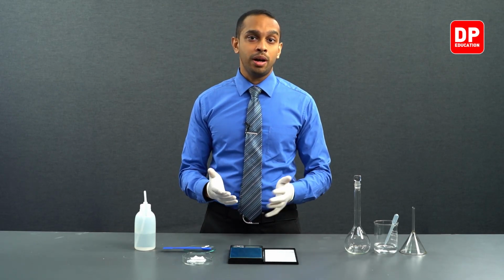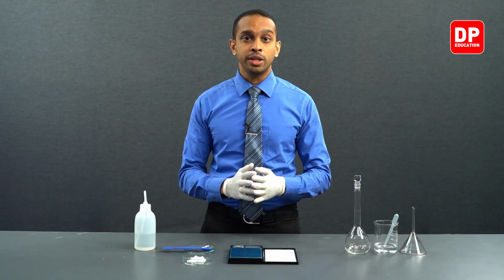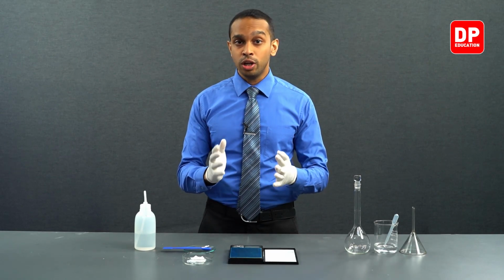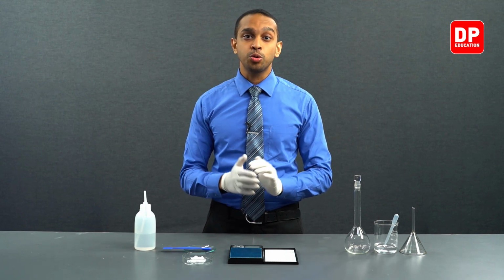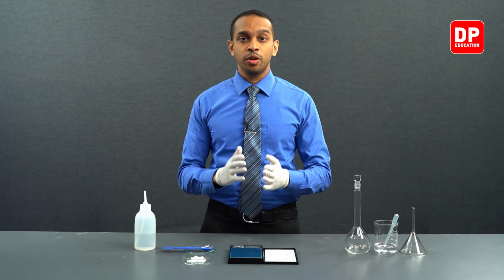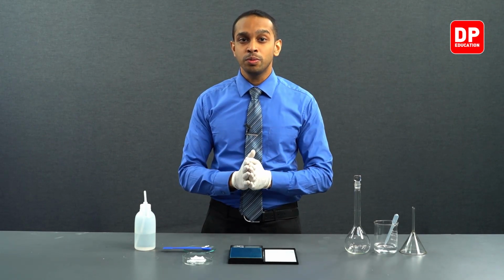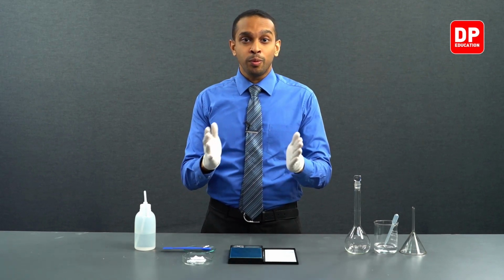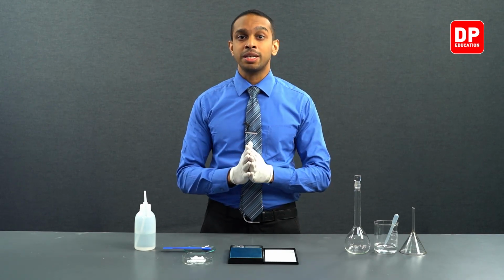We need to prepare a potassium oxalate solution with a concentration of 0.05 moles per decimeter cubed, and the volume of the solution that we are preparing is 250 cubic centimeters. So we know concentration is equal to number of moles divided by the volume. Using that equation, we can find out the number of moles of potassium oxalate that we will be needing for this practical.